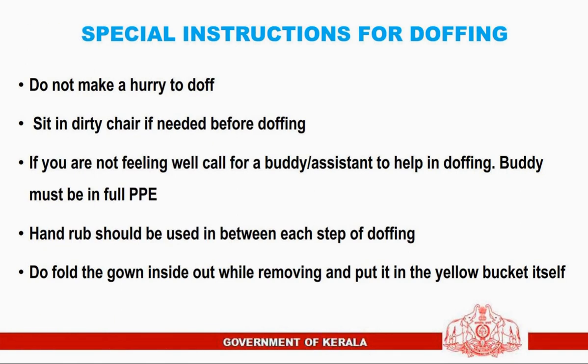Special instructions for doffing. Do not hurry to doff. Sit in the dirty chair if needed before doffing. If you are not feeling well, call for a buddy or assistant to help in doffing. The buddy must be in full PPE. Hand rub should be used in between each step of doffing.